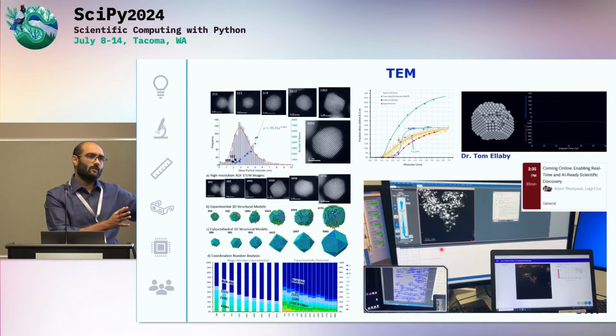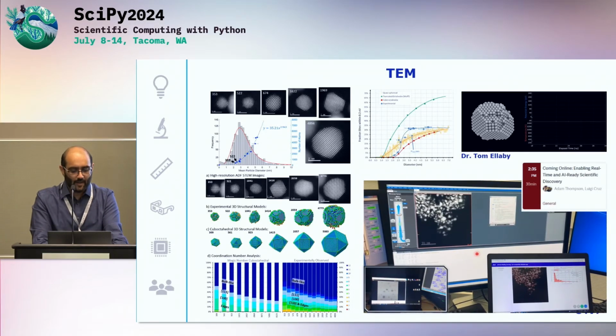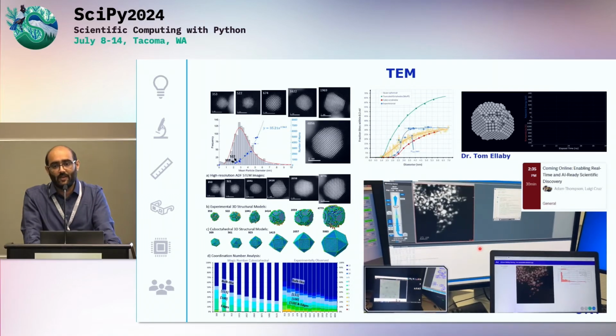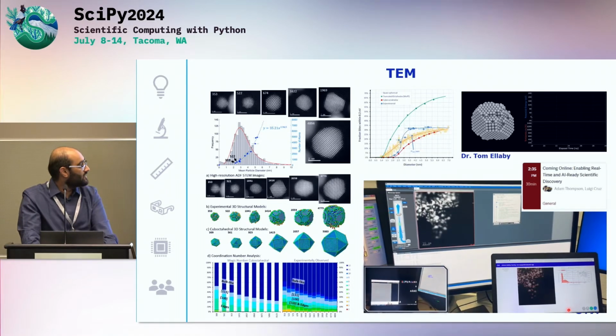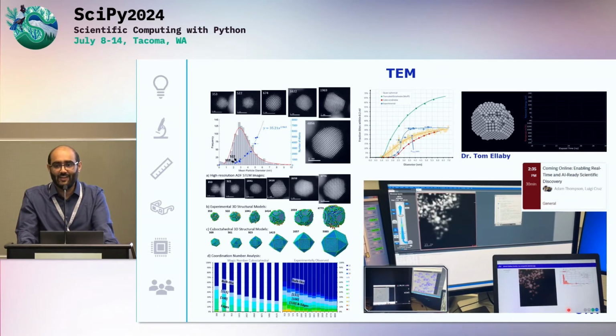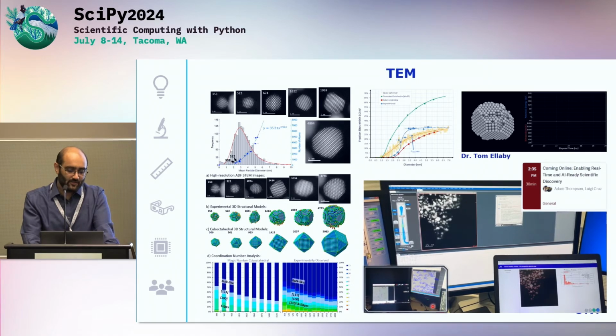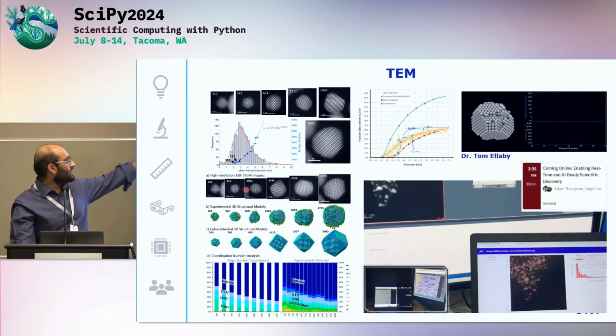And our ambition overall, now, I would say after everything that we put in place, okay, so we've kind of solved a lot of the problems for the micron level. The next step here is actually, can we do this live? And this is the pipeline that we're trying to build in the future. And then can we do this with a web interface? So you can imagine a bit like Twitch TV, but for electron microscopes, where we can actually use deep learning for navigation and whatnot, using all of our structure inversion methods.